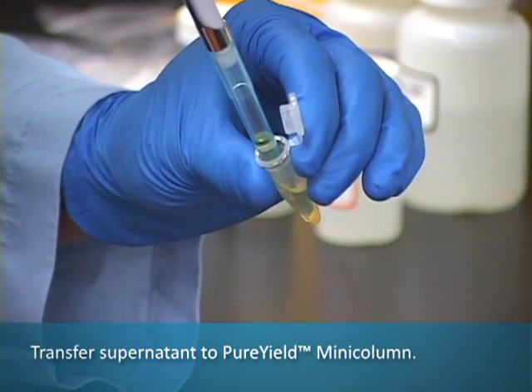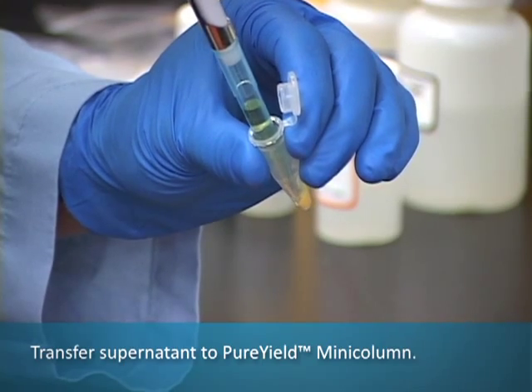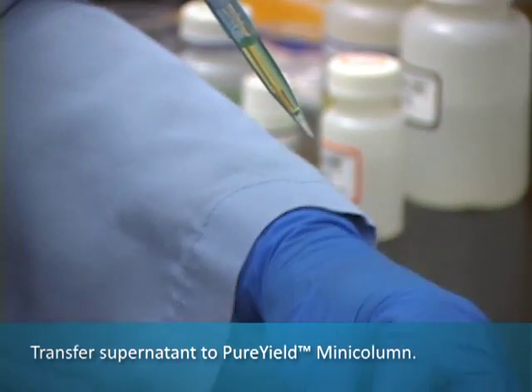After centrifugation, transfer the supernatant to the Pure Yield Mini-Column, and centrifuge at maximum speed for 15 seconds.